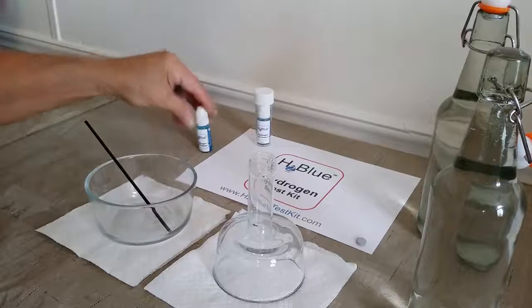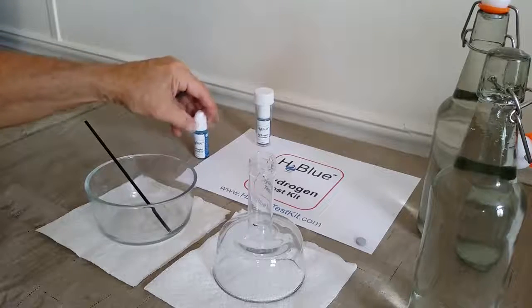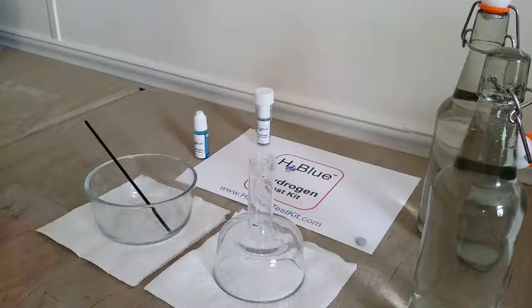A note about H2Blue: it can stain surrounding surfaces, so I like to protect an expensive countertop, maybe not wear my best shirt. If you get it on your skin, you'll have to use soap and water to get it off. So just be aware that it will stain if you're not careful.